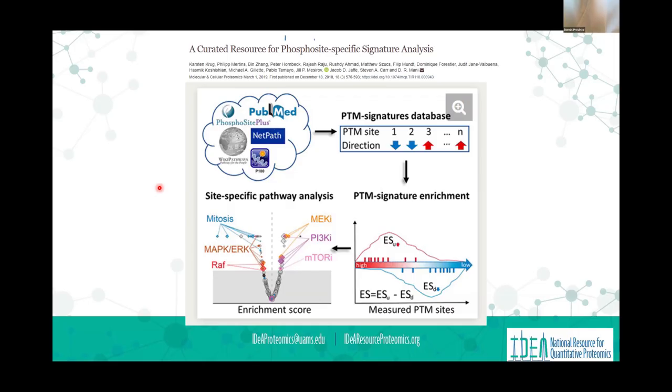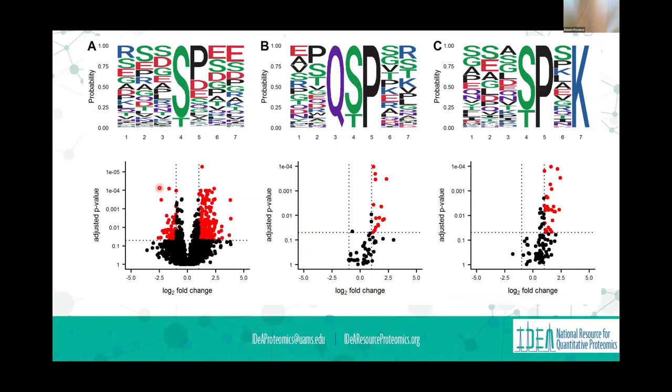Sure. So, what generates the motif figures? This was a previous version of our analysis. Do we have this ability in ProteoDA now, or was this in ProteoViz? This was ProteoViz, yeah, which is also on GitHub.